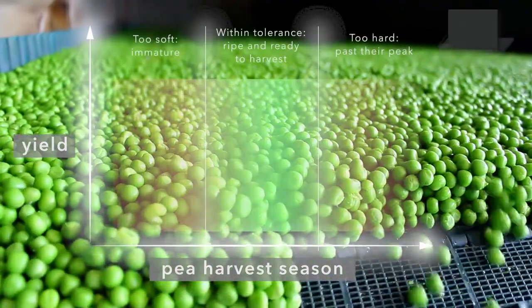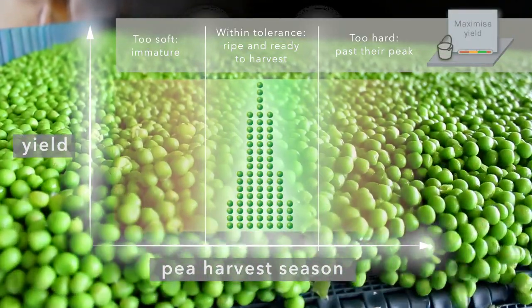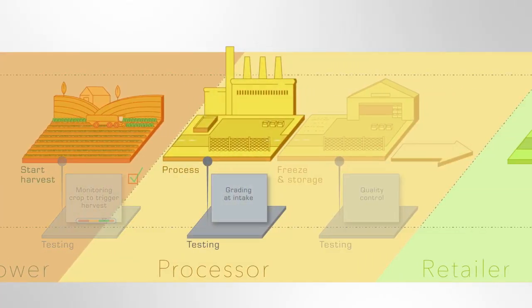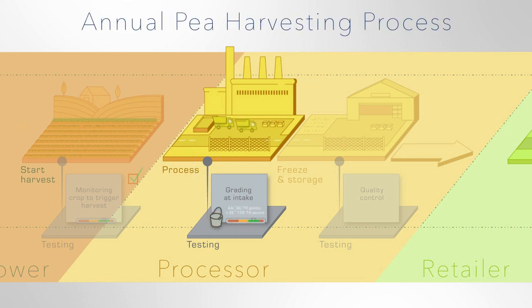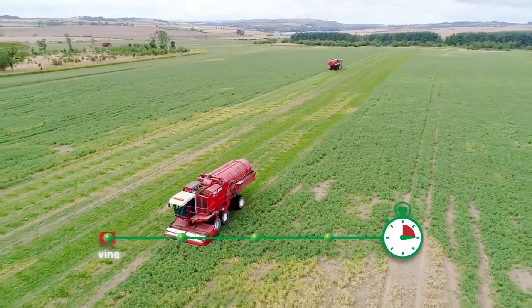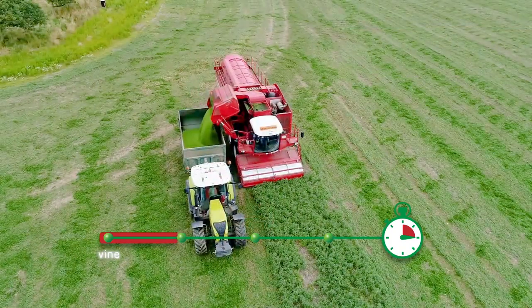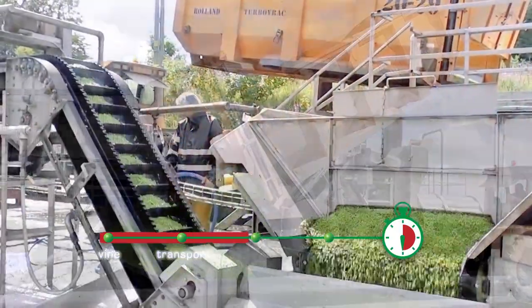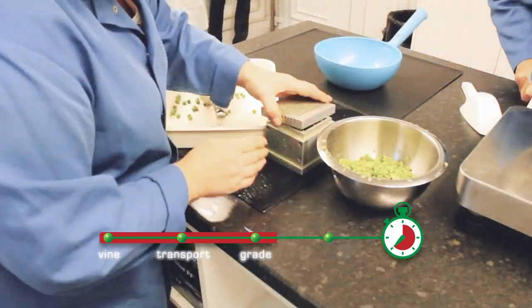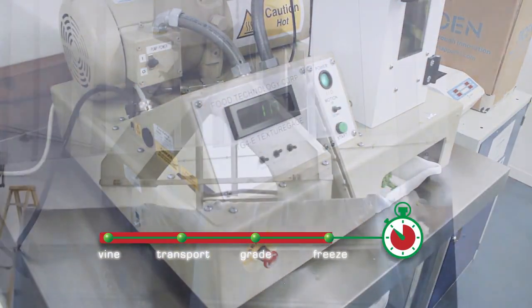An accurate test of tenderness is vital in maximizing yield. Harvest commences and operates 24-7. There is a time-critical window of 150 minutes to vine, transport, grade, and freeze.